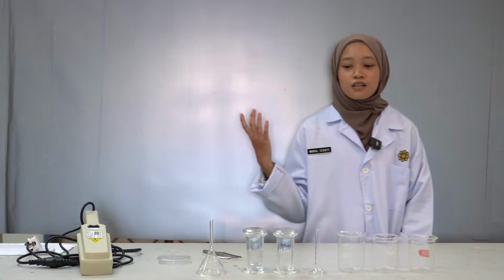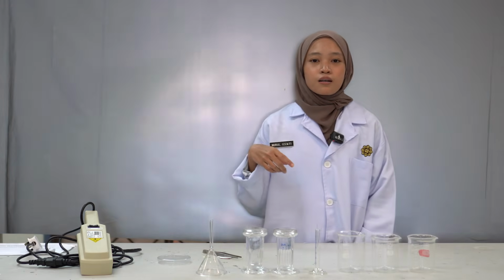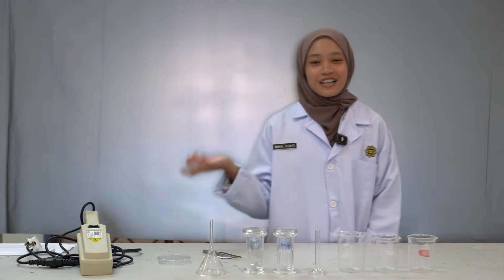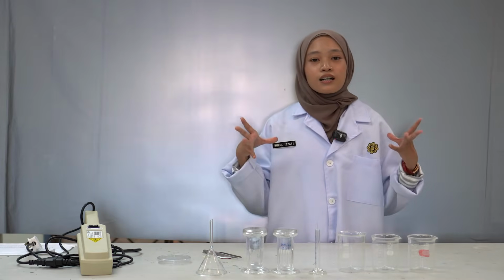Okay, so since we have discussed the theory part of TLC, now I am going to tell you about the application of TLC and where TLC is used in industrial settings. First and foremost, perhaps the most critical application is in the pharmaceutical industry.